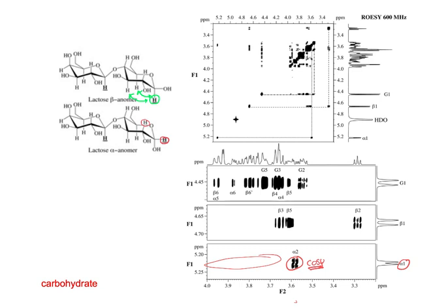All right. So you can do these 1,3 diaxial interactions, though. But in proteins or in DNA, where they have these helices, they can see NOEs along the helix, right? Which would be actually quite a few bonds away. But it's good for these 1,3 diaxial positions as well.